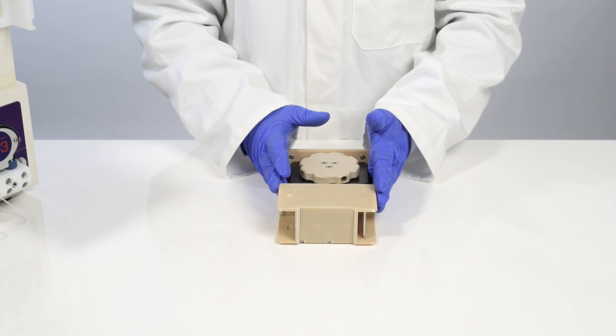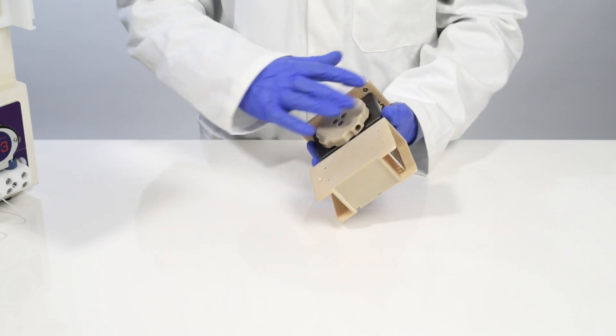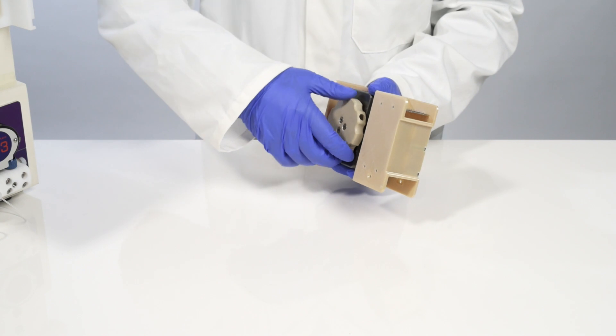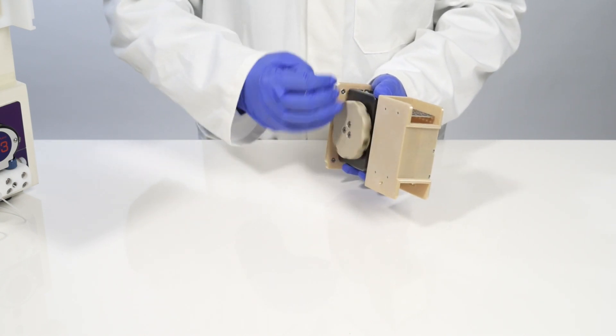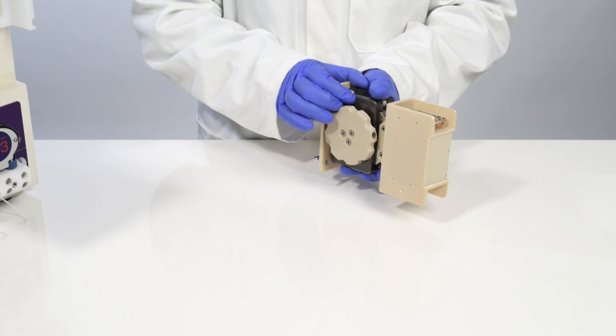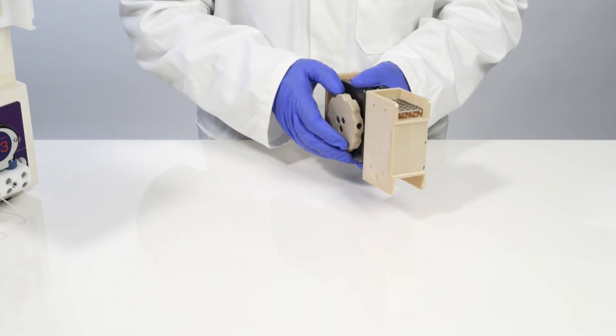Now I've removed the reactor, I'm going to disassemble it so that I can change the configuration inside. To do that I first need to unscrew the clamp. The clamp provides compression to the two plates which enables you to operate the reactor at pressure.